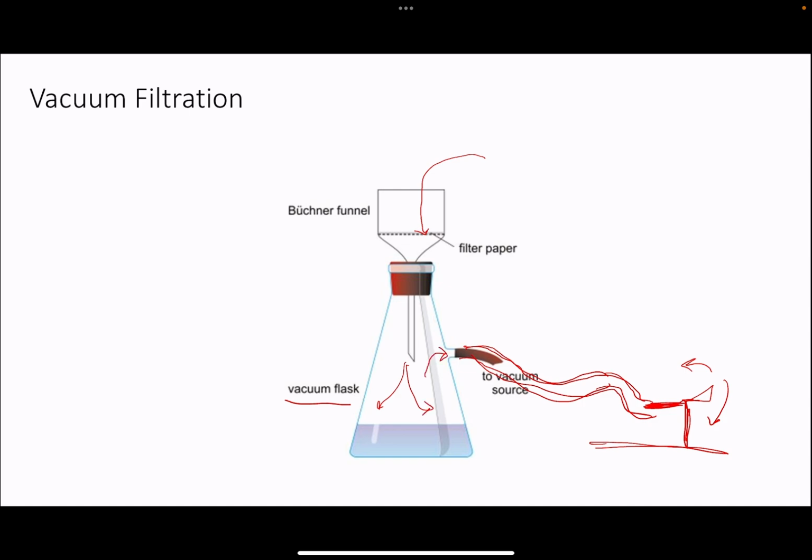And so the Buchner funnel is a ceramic funnel that has holes at the bottom. So what you're going to do is put filter paper that fits perfectly at the bottom of this Buchner funnel, and you'll just spray it with DI water, make sure it's rinsed, and you'll see once you turn the vacuum on, that water will just shoot out into the bottom. It's a really great method for drying out or isolating any dry products from solution. So that's exactly what we want.